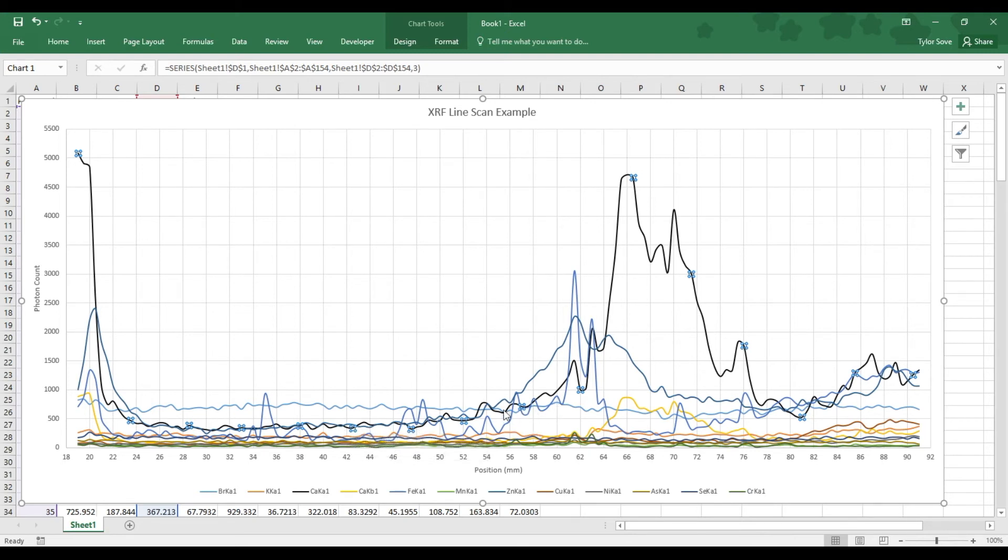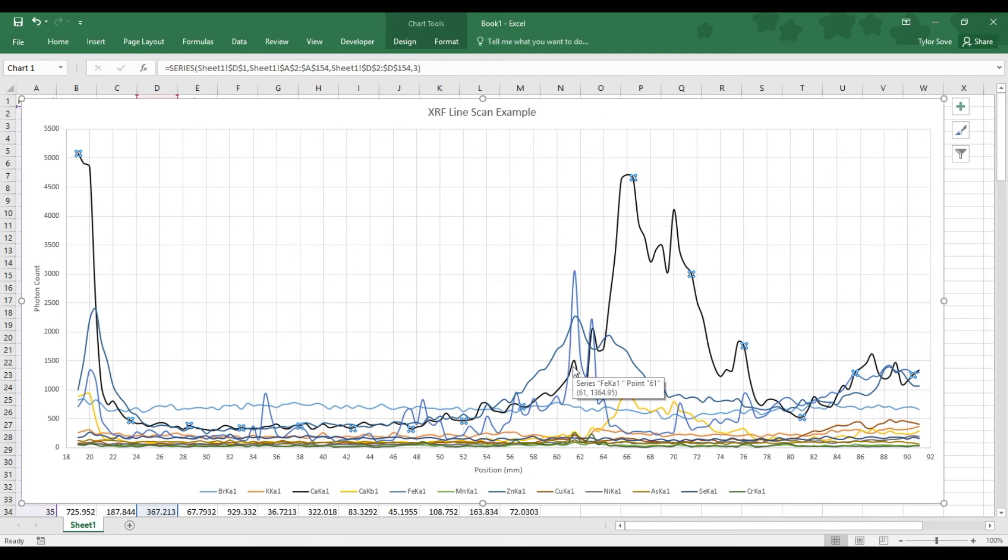We can see also that where the calcium started to rise, the zinc does as well, but the zinc reaches its peak concentration before the calcium does. They generally follow the same trend of increasing together.